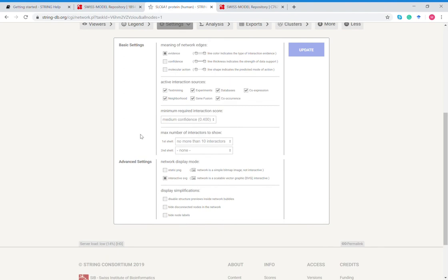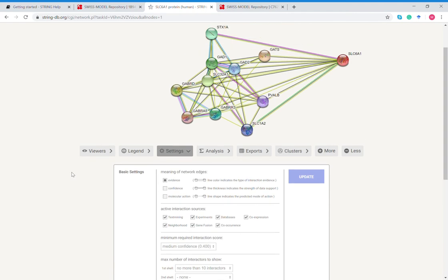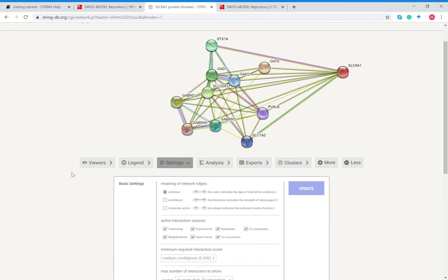Like I said, you can change this. This is default, the first shell contains no more than 10 interactors, but you can change that to 20, 50, custom value. And then the second shell you can change that as well. So potentially you could have the first shell with 50 and second shell with 5.